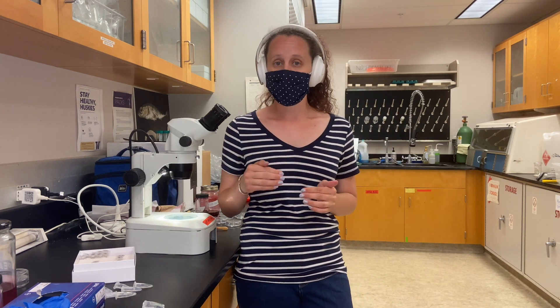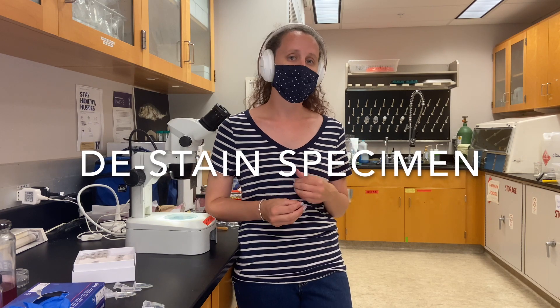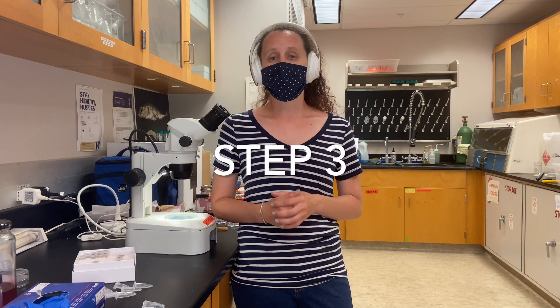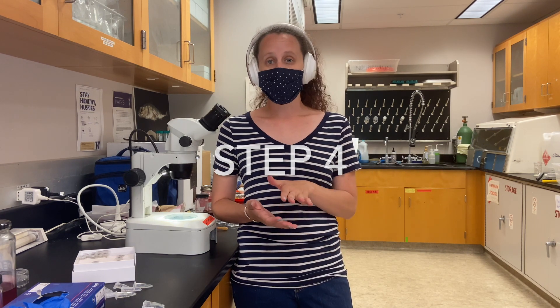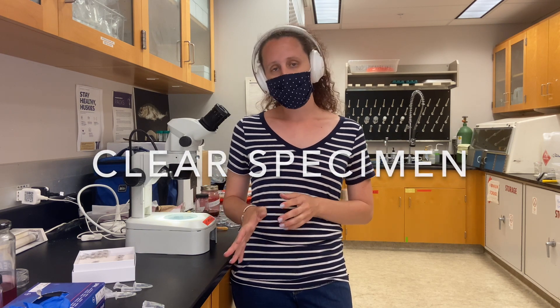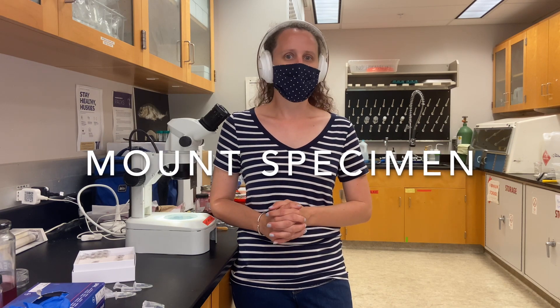After that, we'll de-stain them because they'll be overstained from sitting in the stain overnight. We de-stain them to bring them back to a nice, light, pretty pink color so we can see them easily. We'll then stop the de-staining process, clear them — which makes them see-through so we can see all the way through them — look at all the organs inside, and then mount them. Canada Balsam will preserve them for the next, hopefully, hundreds of years.